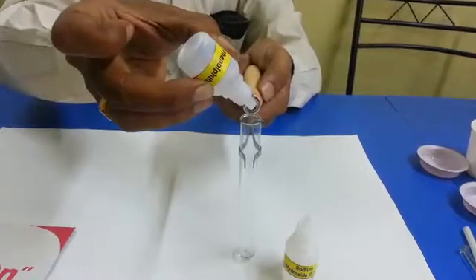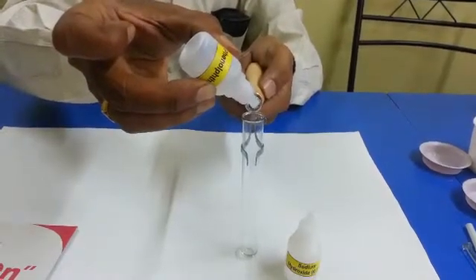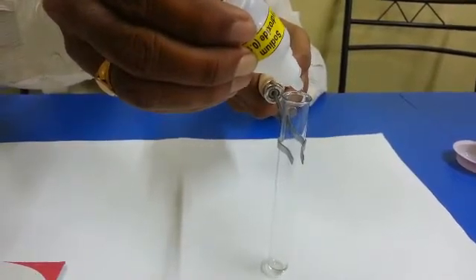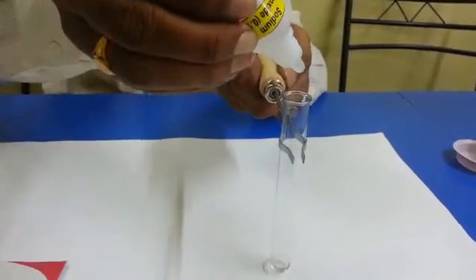Add one drop of phenolphthalein into hydrochloric acid. Now add NaOH solution drop by drop and count the number of drops.